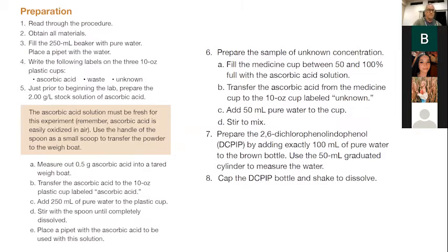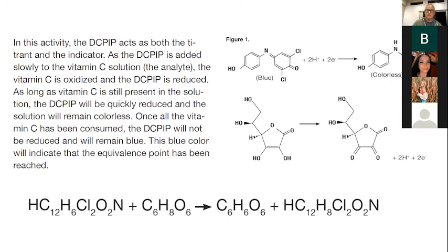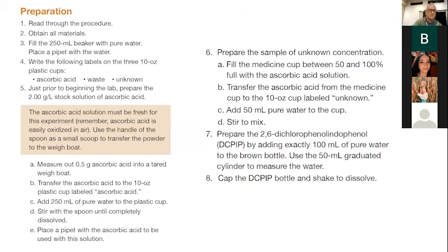So we weigh out precisely, oops, go back. You weigh out precisely 0.500 grams or thereabouts. And then we'll dilute that to 250 mils.